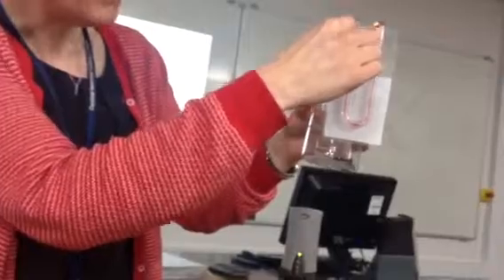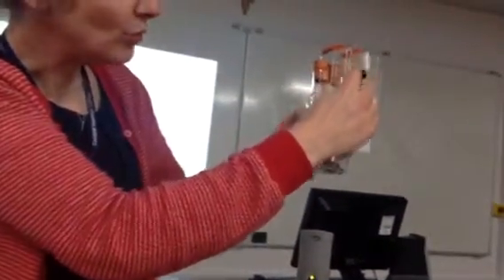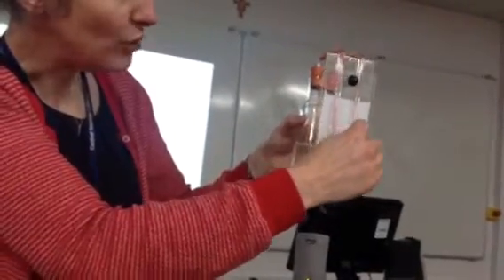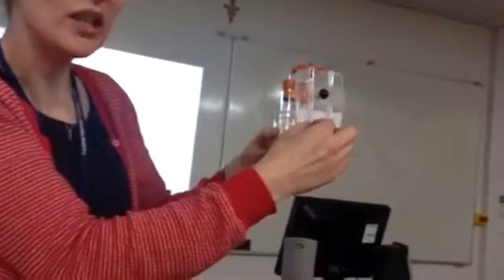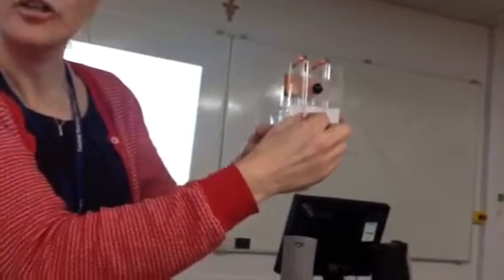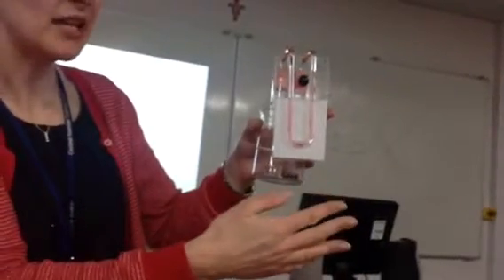So at the moment I've got a red trace up here, and this whole volume of air can be taken into here, into the peas. They will respire, the carbon dioxide will stay in there, so hopefully this trace of red will move down the tube and then move up. And I can measure, using this graph paper here, the distance moved by this red fluid. If I measure the distance moved by the red fluid, I will be able to calculate, knowing the diameter of this cylinder, the volume of oxygen that these peas have taken in to respire. Does that make sense to everybody?